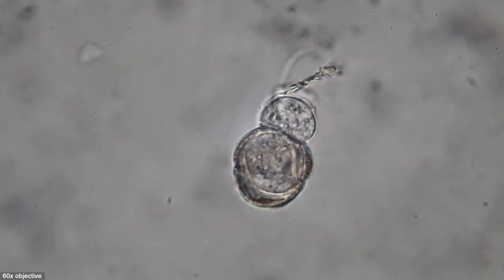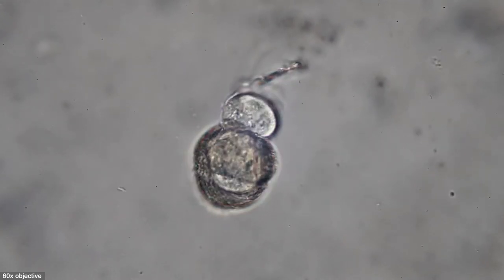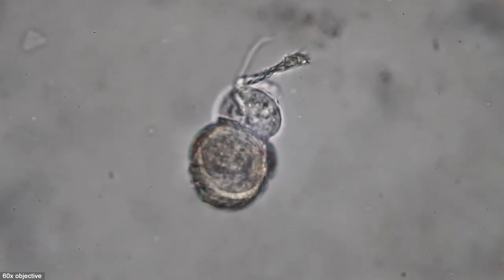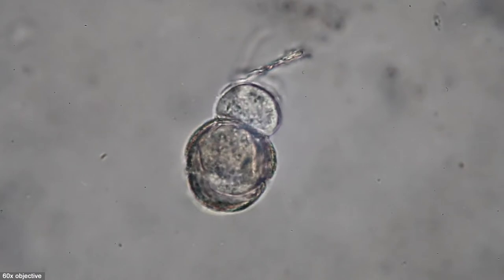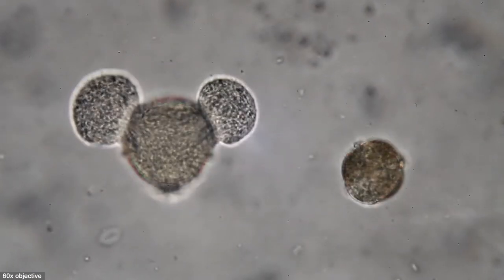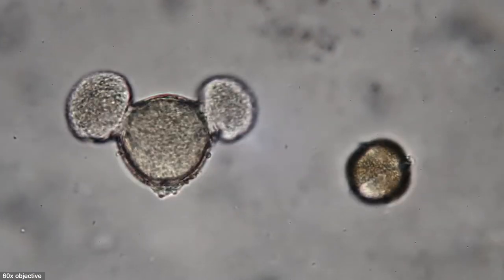Some of them looked kind of irregular, like this one over here. I'm zooming back. Not zooming. I'm focusing back and forth so that you can actually... It looks like a Mickey Mouse a little bit.